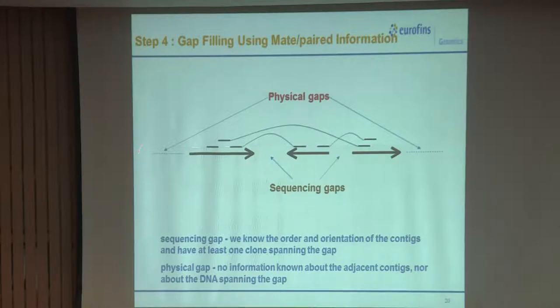And in these cases, what will happen? It will break into two scaffolds. I do not know whether scaffold 1 is after scaffold 2 or not, but there is something. So the scaffold will be breaking there. We do not have information in between about what is there. But if we have information in between, I will have ends in it and it will form a scaffold. So these are two types of ends.